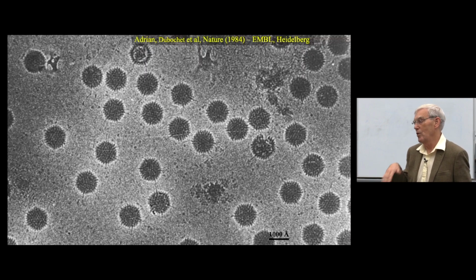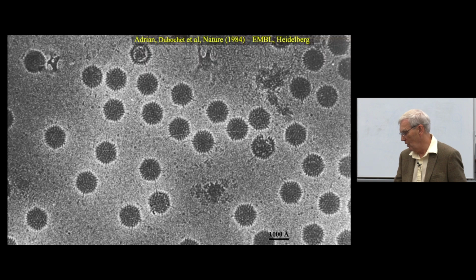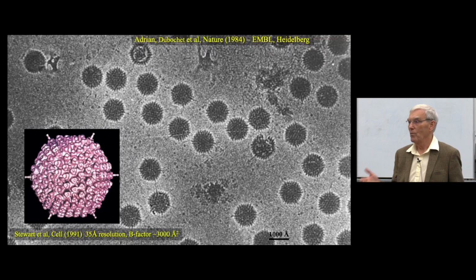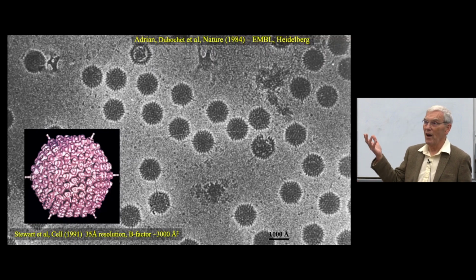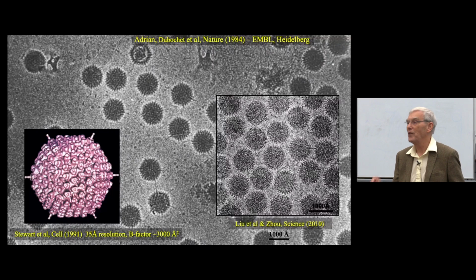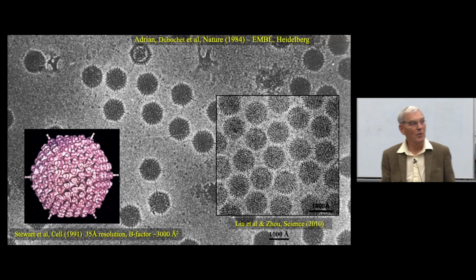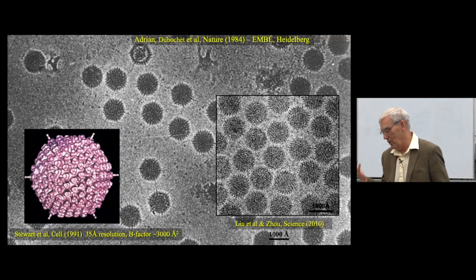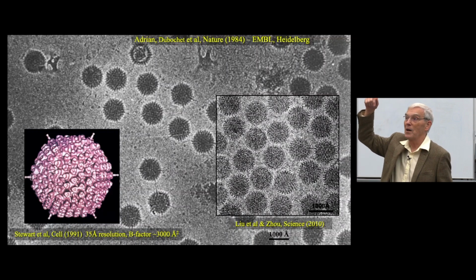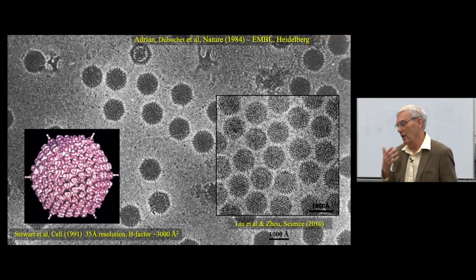But that was 1984, and the computers weren't very powerful, the programs hadn't been written yet, and it took them 6 or 7 years to go from that 2-dimensional image to this 3D structure here, which is a sort of blobby structure, 30 to 40 angstroms resolution. You could see the subunits, but not much more, and then it took about another 20 years to go from images like that to images like the one on the right now. You can see now that there's more detail in the image, and that was a higher voltage microscope with a much brighter, 1,000 times brighter electron source that gave you coherence, so it didn't go fuzzy when you tried to bring it into focus.